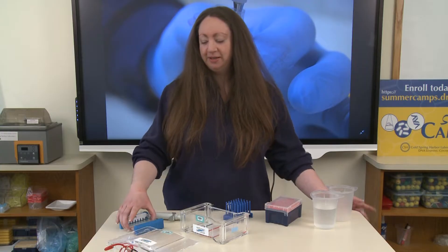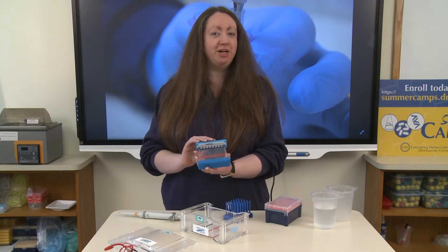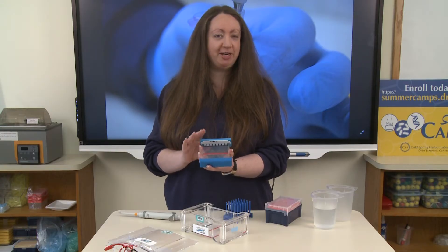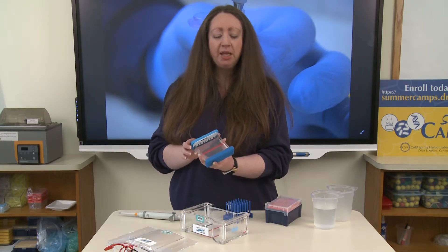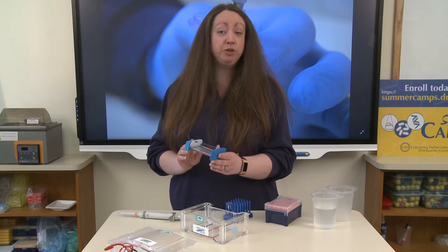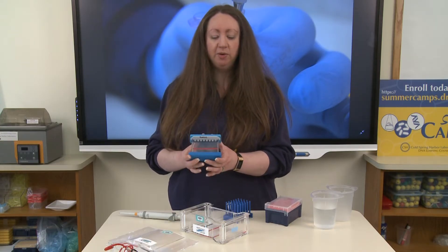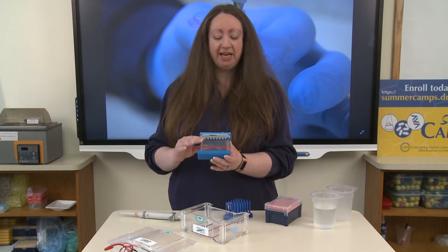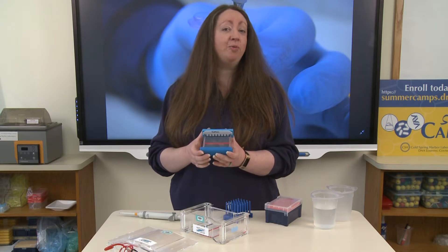Hello everyone. Today we're going to talk about how to set up and load an agarose gel. Here I have an agarose gel — we have another video showing you how to pour one, but here we have one that's already set. Agarose is a polysaccharide that comes from seaweed, so it is highly purified. We've mixed it with a fancy saltwater buffer, let it solidify inside of this casting tray, and we are now ready to load.